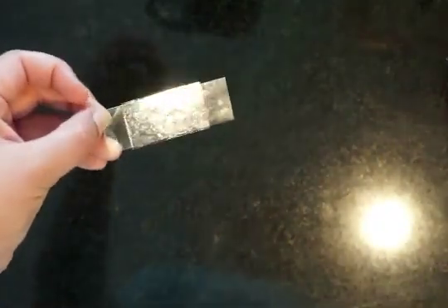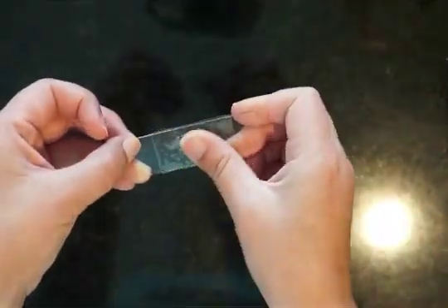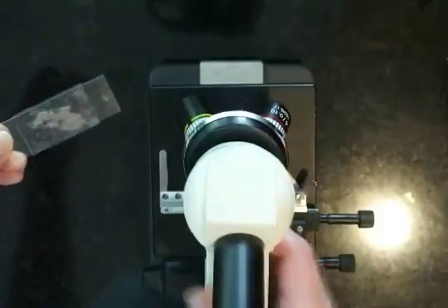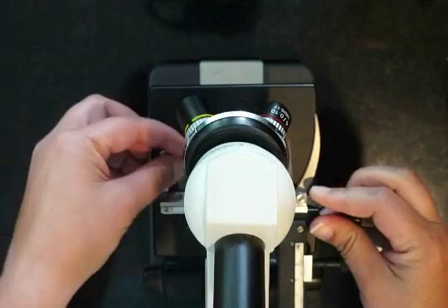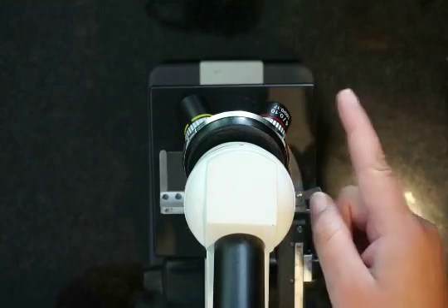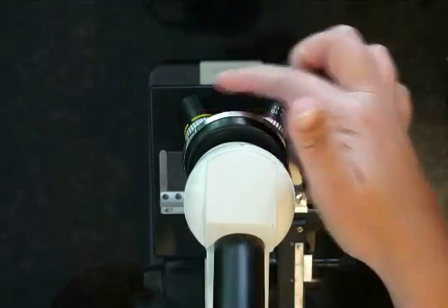So there's your slide, and we're going to take a look at it here on low power, medium power, and high power. As always, we're starting on low power with the stage all the way down, and I'm bringing it up slowly until I focus on our object.